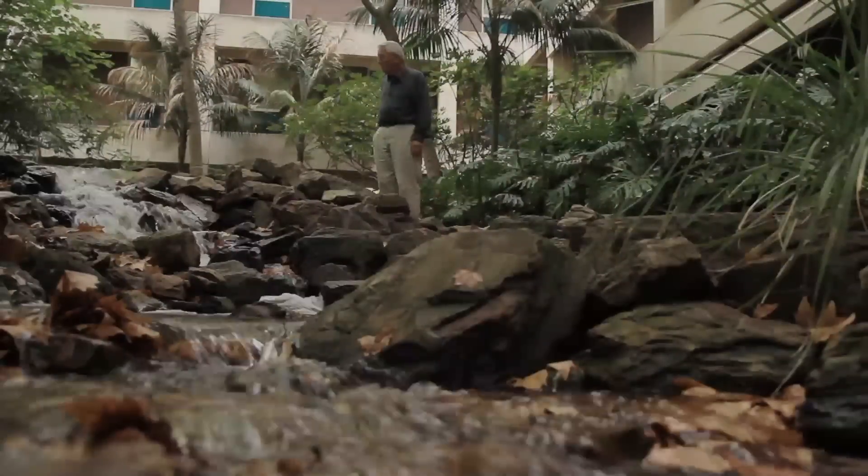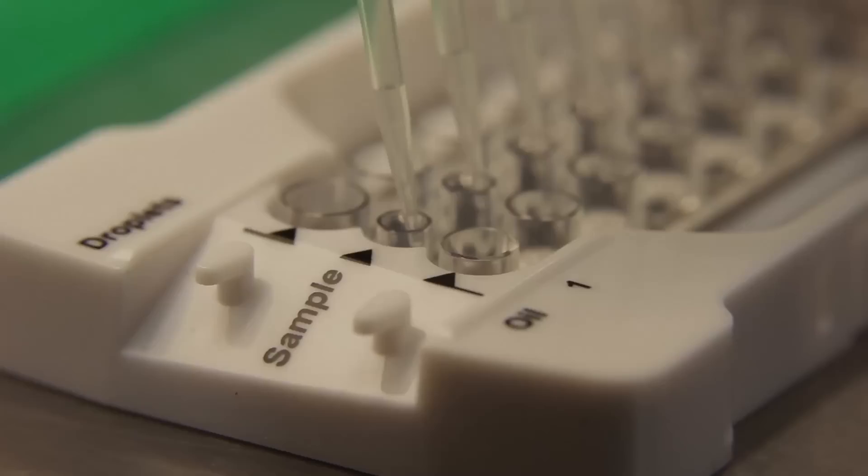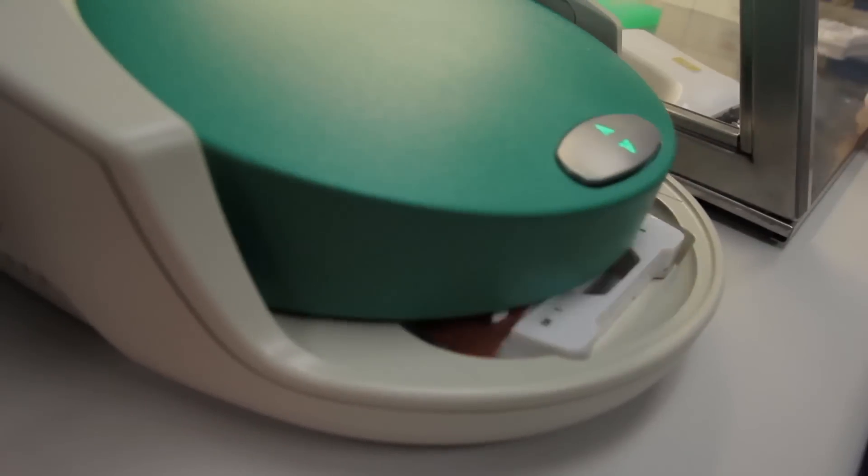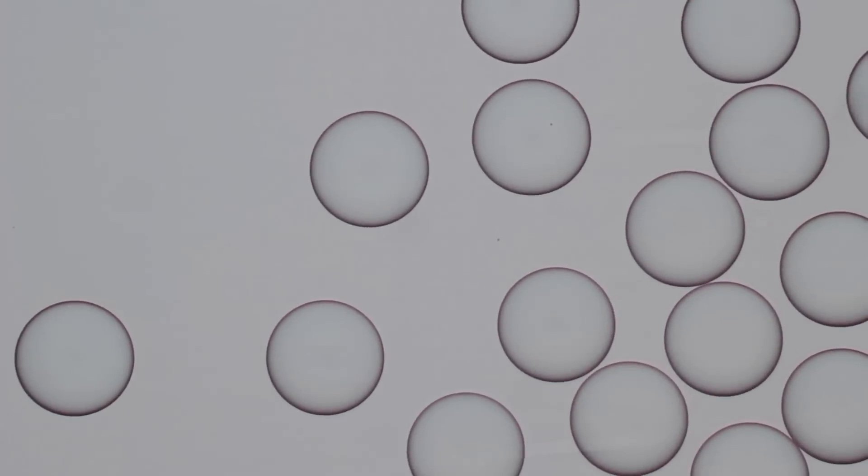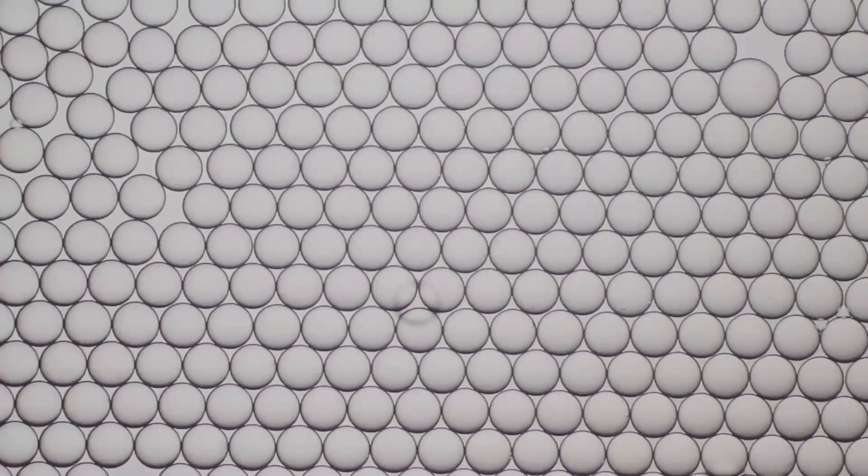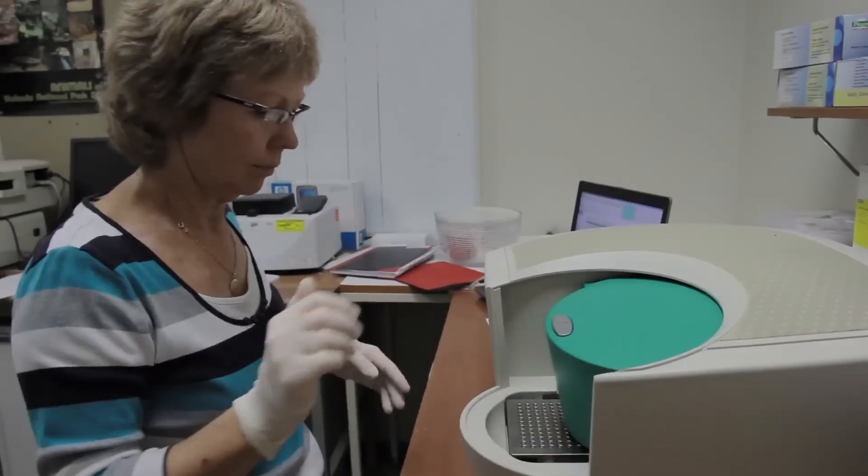The essence of Digital PCR is that you have to perform multiple replicates. Droplet Digital PCR enables you to do this, to produce the replicates. Each replicate is a droplet. You get 20,000 droplets set up in a few minutes and read in a short time.